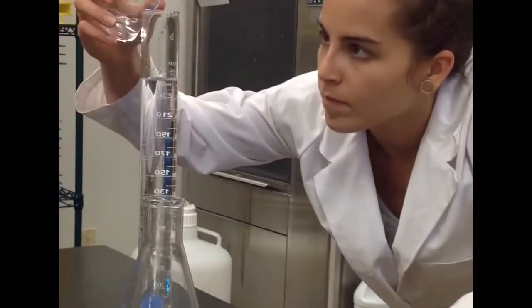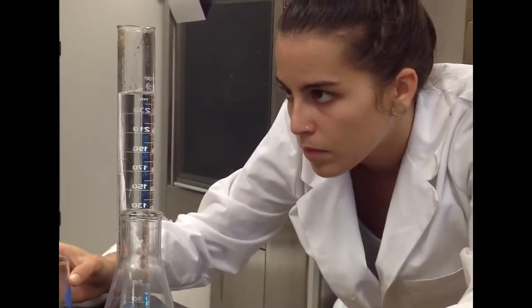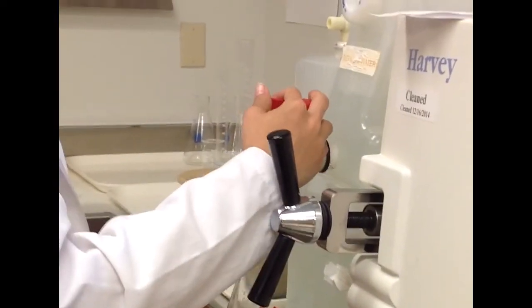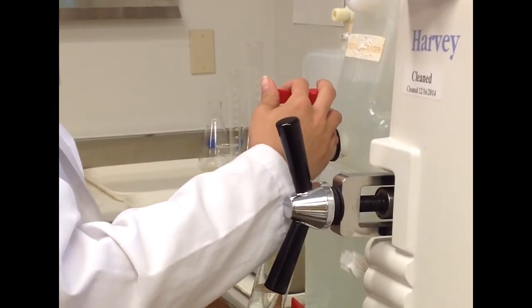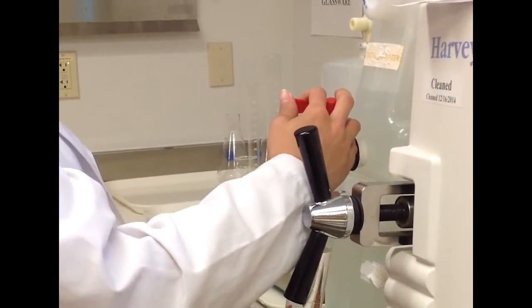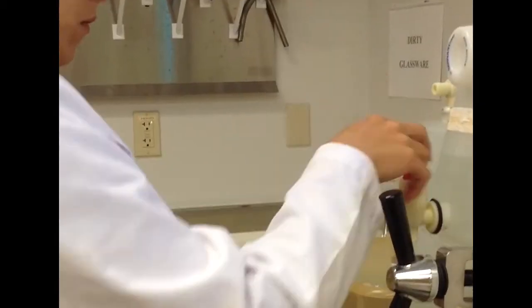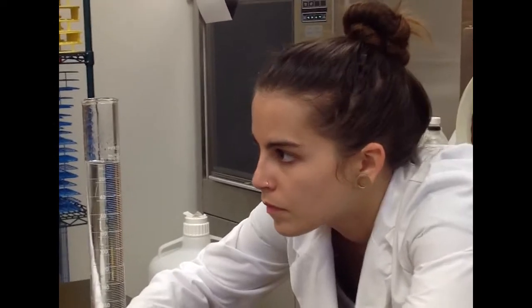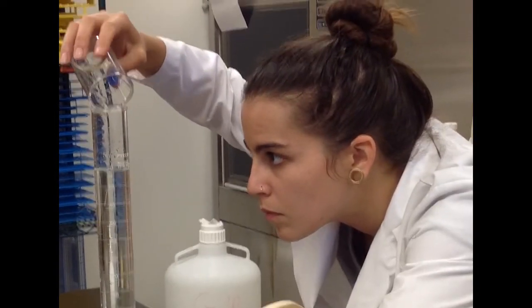broth and water. First, we took distilled water and measured it in a graduated cylinder, 250 milliliters of that distilled water. We poured that into a 500 milliliter Erlenmeyer flask, and we slid a stir bar, a magnetic rod, into it. We covered it with a layer of aluminum foil. We placed a little autoclave tape right on top to signify that it had not gone into the autoclave yet. And we repeated the process several times according to how many different concentrations we had.